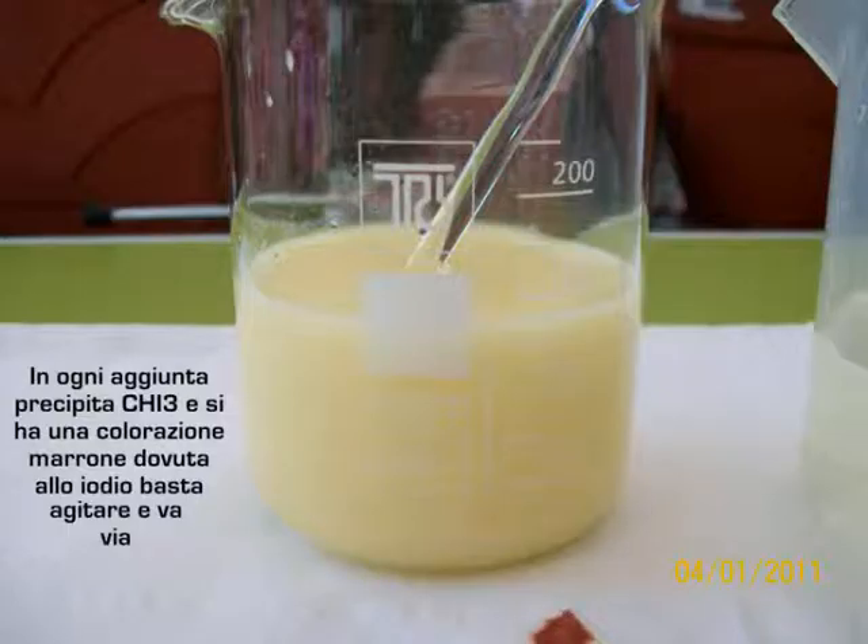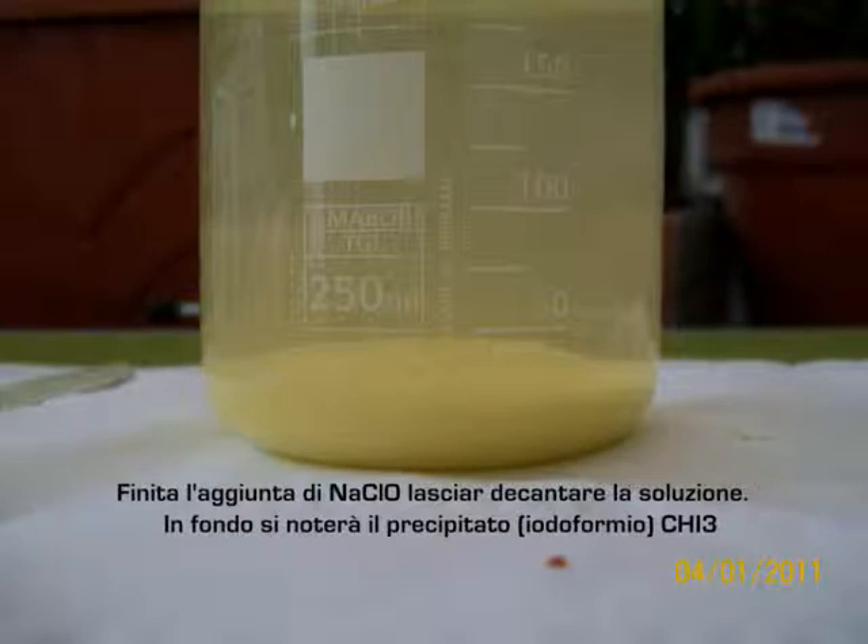For each addition, a precipitate is observed and there is a brown color due to the formation of iodine, which disappears by shaking. After the addition, stir for 10 minutes — there will be a yellow precipitate of iodoform.